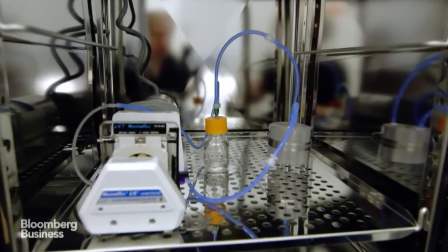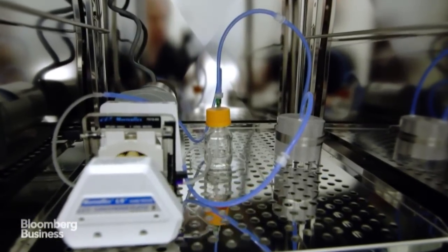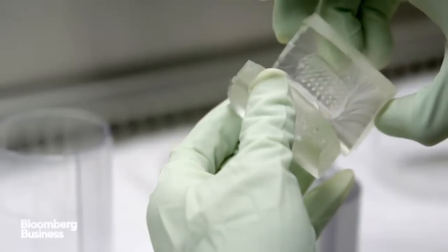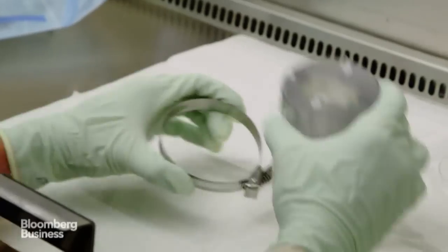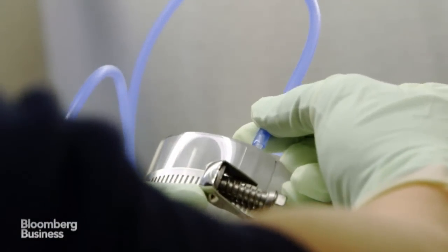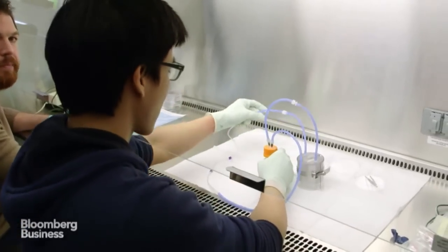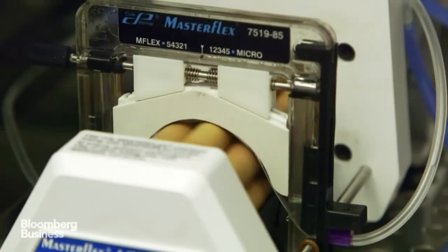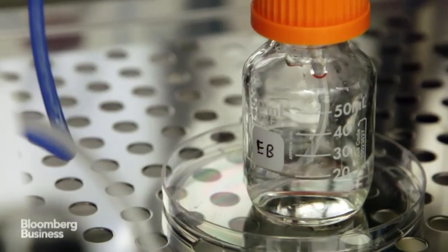You've got to keep it sterile, you've got to keep it moist, and you have to keep it fed. That's why it's perfectly housed in here. This is silicone material that is perfectly matched to the shape and shunts the fluid that feeds the cells evenly through the scaffolding. The entire process from harvesting the stem cells to incubating the bone in the bioreactor takes about five weeks.